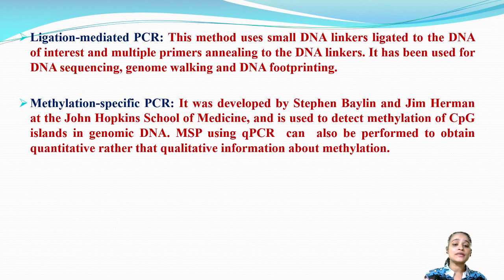Methylation specific PCR, using quantitative PCR, can also be performed to obtain quantity rather than quality information about your methylation. That's why it is called methylation specific PCR, where you use quantitative PCR which gives you the quantity of your methylation rather than the quality information.